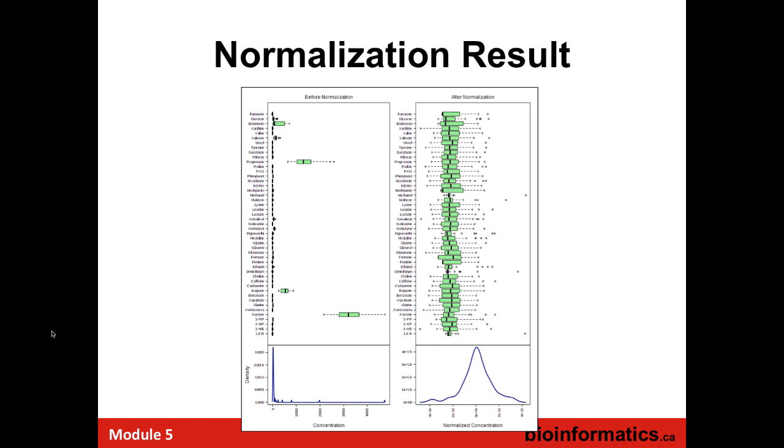With microarrays, what you do is you compare each feature. Instead, when you do this normalization, autoscaling is across. All the normalization is you select one and apply it to everyone. We don't treat any individual features, each feature using its own normalization. If you really want to do that, you can. But if software tools allow you to apply different algorithms on different features, that's going to be so complex. You can do it, but it's usually not recommended for omics data.